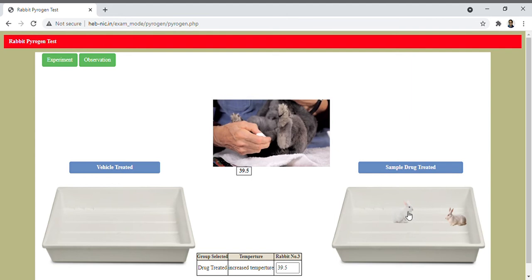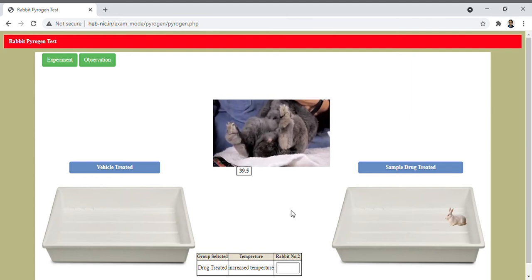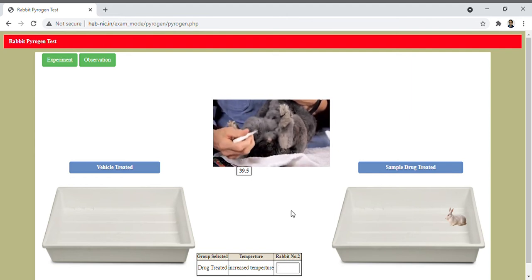Then select the second rabbit and record the rectal temperature.